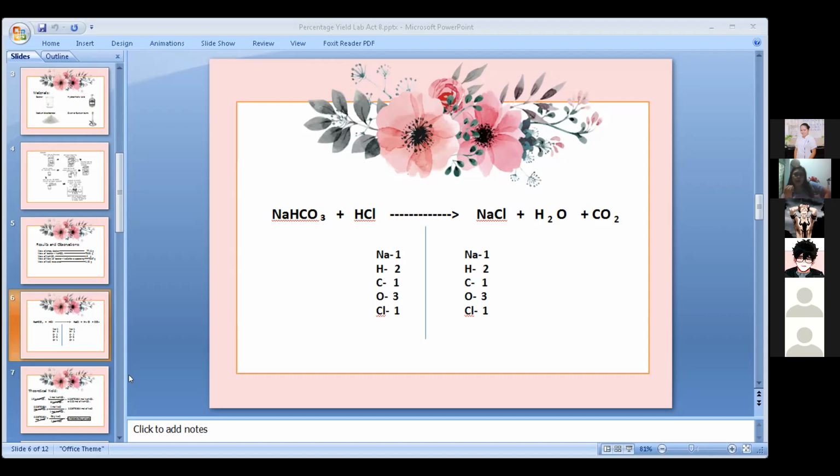Nya ang nakuha 1.45 lang. Ang pwede nato nga explanation ana naay error pud sa atuang procedure. So wala man ta kabalo kung paano gi-perform ang experiment, why wala nato nakuha ang tama nga yield, nganong naay kulang.